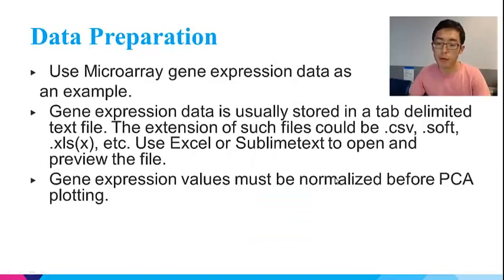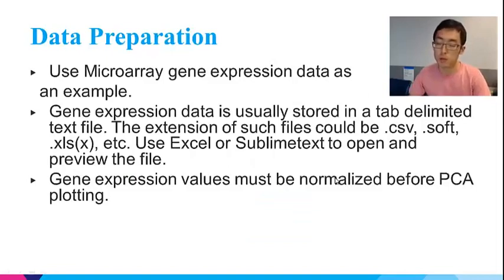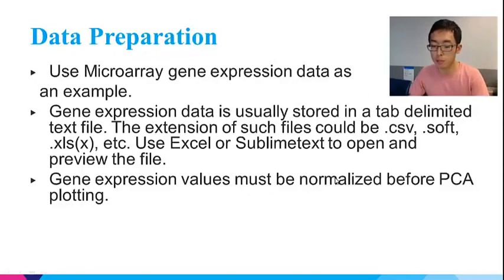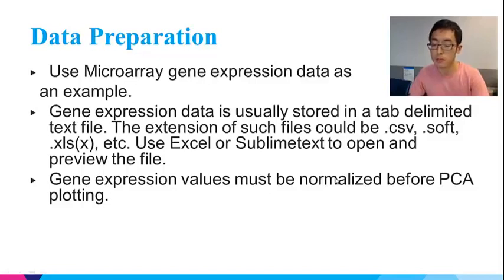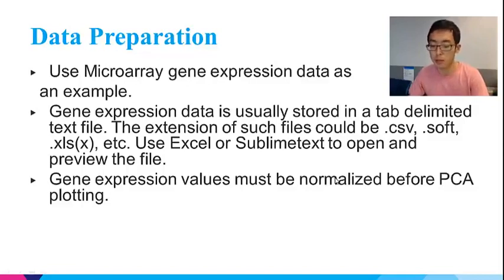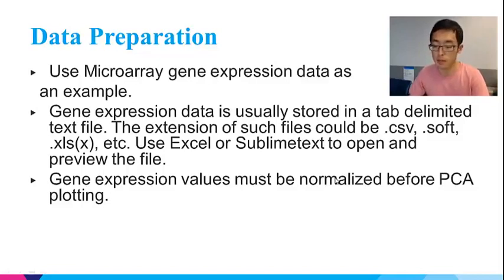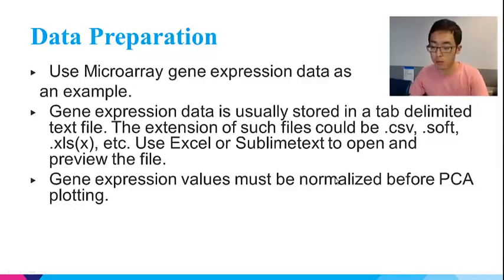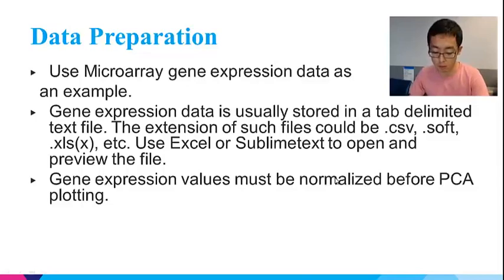I will use micro gene expression data as an example to make a PCA plot in MATLAB. The gene expression data is usually stored in a tab-delimited text file and the extension of such files could be .csv, .soft, .xls, etc. Use Excel or Sublime Text to open and preview the file. Gene expression values must be normalized before PCA plotting. Okay, we will do the demo now.